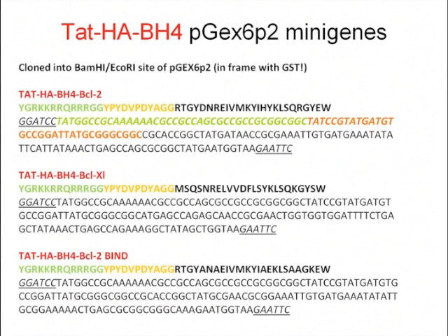No. Okay. I have to say that with the 6His, we have had some issues, not particularly with these peptides, though, but I know this might be an issue, that the His tag is not always convenient to work with and that it might be hidden. I would say with a short peptide, you would not think that there is such a problem.